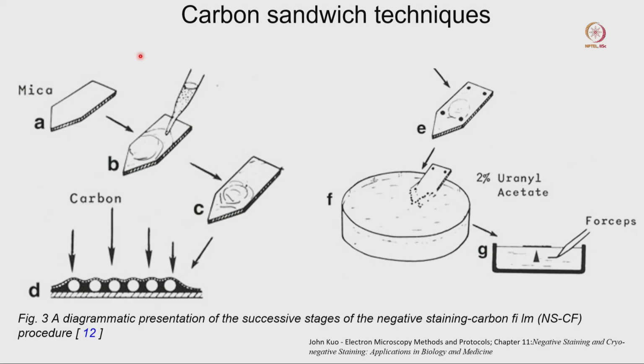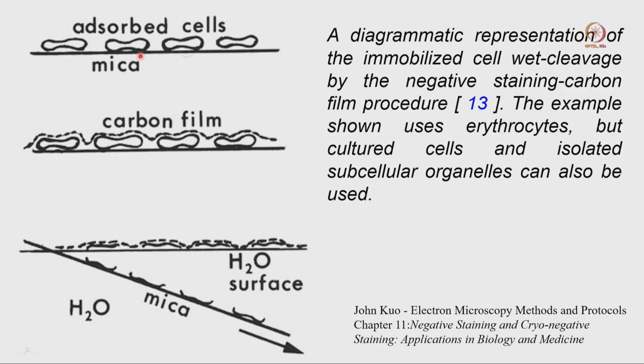But this is a very unique technique that we can use for sample preparation. There are other methods also. So, here you have a mica, and in the same way you detach the mica first. When you detach the mica, we can expect that the inside is cleaner and there will be no scratch or other part which can make the sample adhere badly, so that you cannot separate the sample.